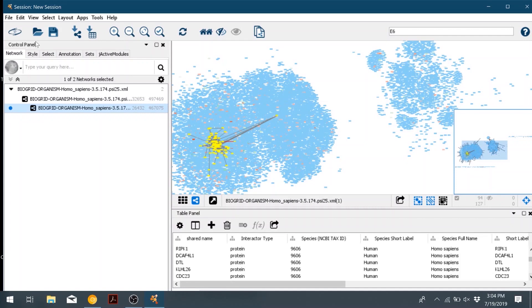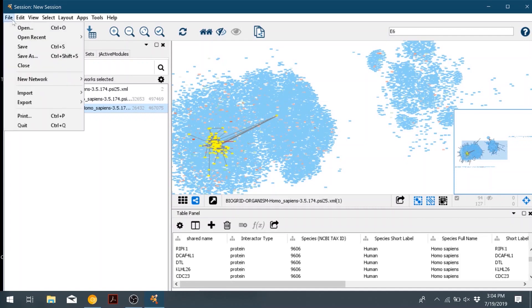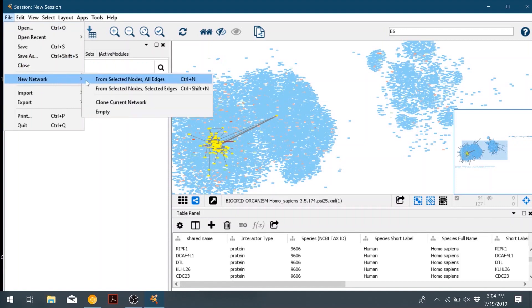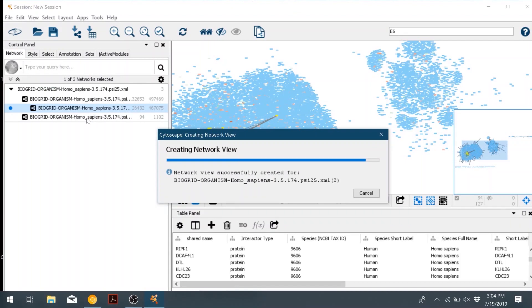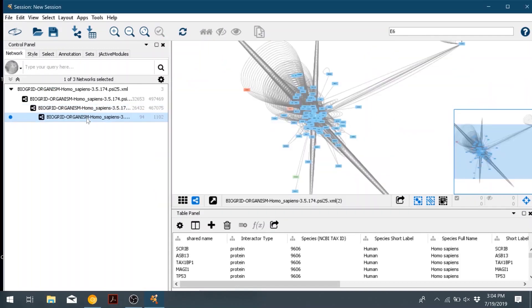So now we're going to create a sub-network showing just these nodes. Go to file, new network, from selected nodes, all edges. And then that will create the network with just all the interactions with E6.